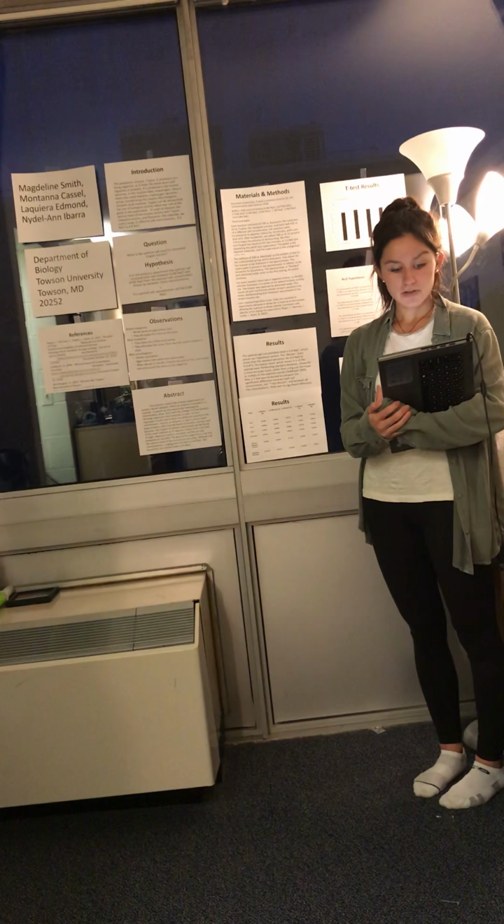Our question for our hypothesis is, what is the optimal salt concentration for increased trypsin activity? And from what my group concluded from the first trial of the experiment, our optimal salt concentration will be 0.0 moles of NaCl.